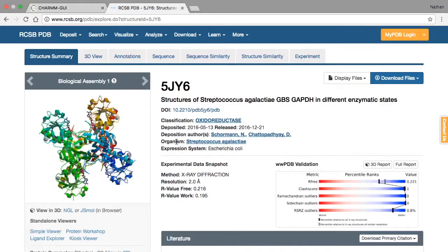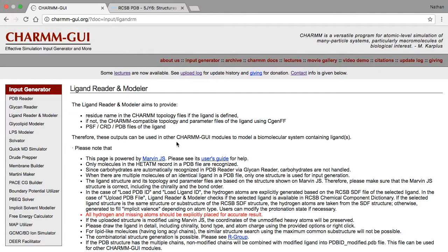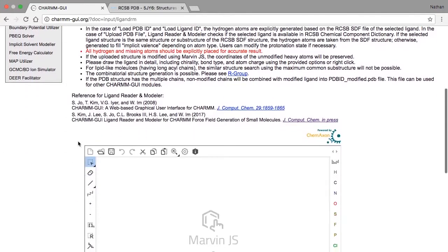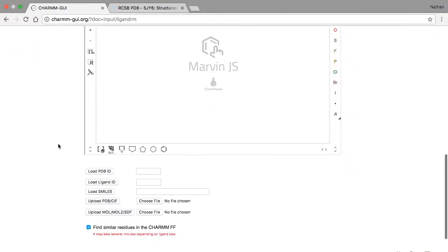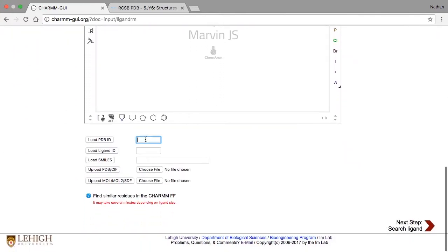The structure 5JY6 contains a protein and its ligand, which is nicotinamide adenine dinucleotide, or NAD. To extract this ligand from the PDB structure, type the PDB ID below the canvas, then click Load PDB ID.